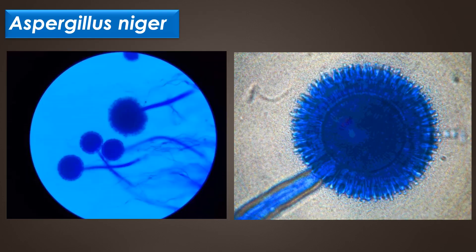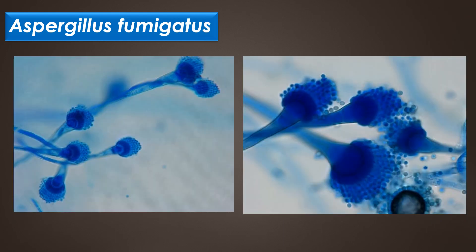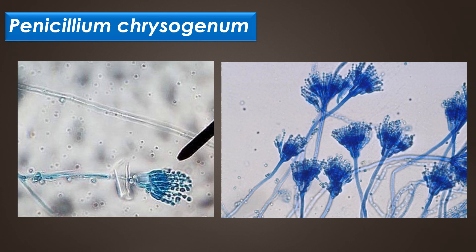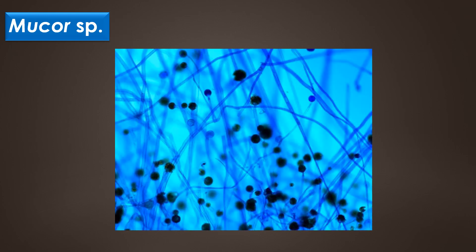This image shows the Aspergillus niger structure under lactophenol cotton blue staining. This image shows the morphology of Aspergillus flavus under LPCB staining. This image shows the morphology of Aspergillus fumigatus under LPCB staining. This image shows the morphology of Penicillium chrysogenum under LPCB staining. This image shows the morphology of Rhizopus species under LPCB staining. This image shows the morphology of Mucor species under lactophenol cotton blue staining.